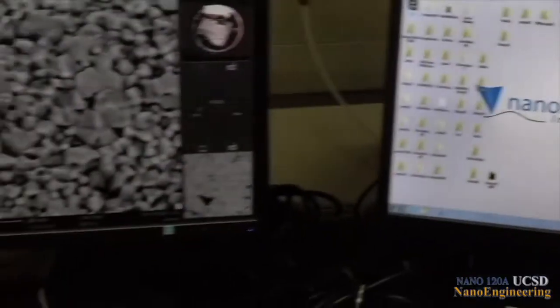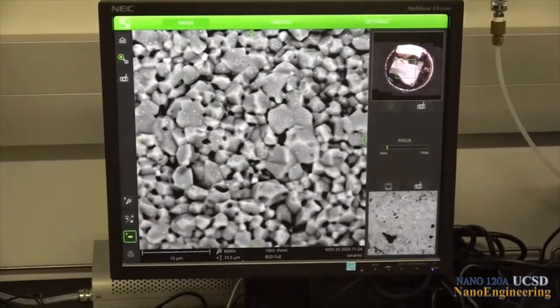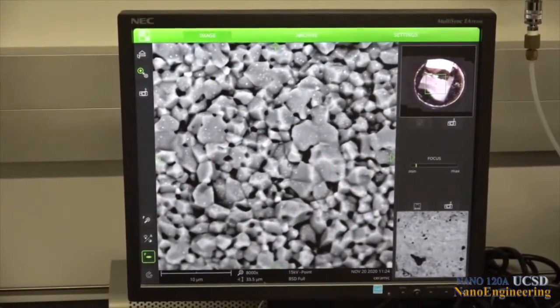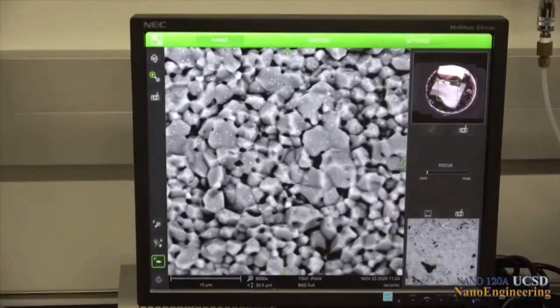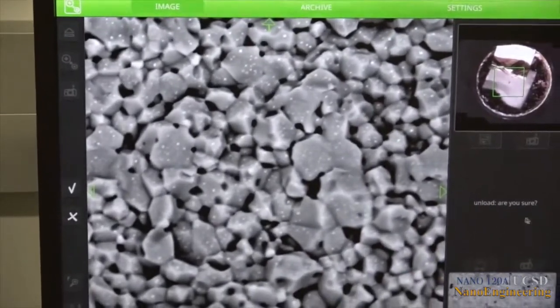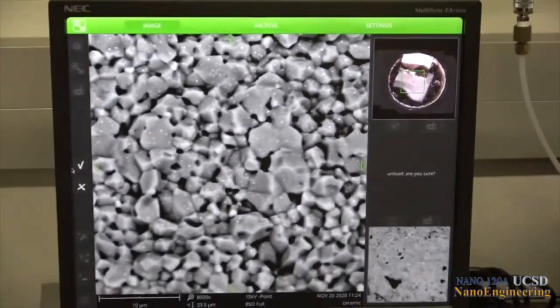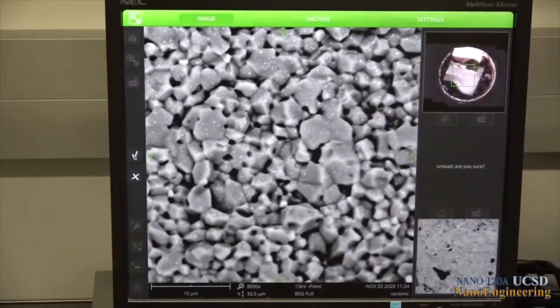To remove your sample from the SEM, go to the SEM screen and click on the icon at the top left of the screen showing an upward arrow with two lines underneath it. Again, a message will appear on the right side of the screen asking if unloading the sample is what you want to do. You can respond by clicking on the X mark for no or the check mark for yes that now appear on the left side of the screen.